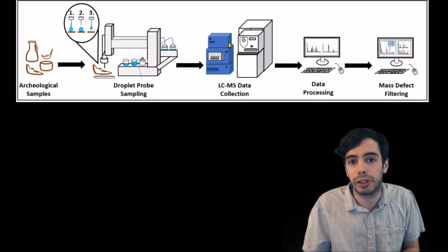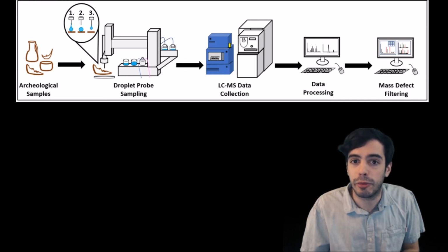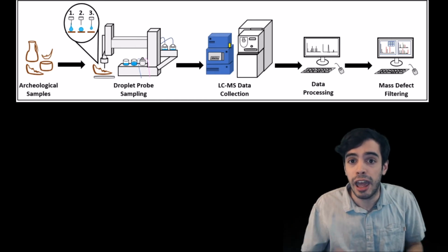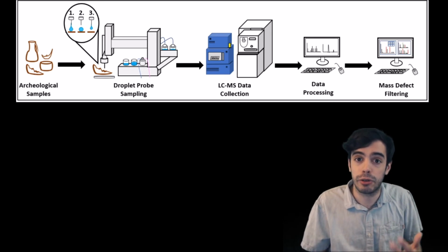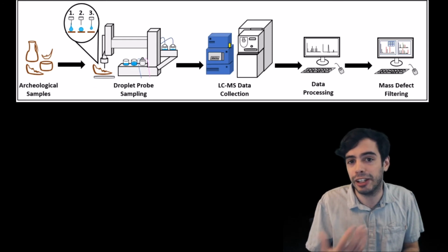And the liquid chromatography coupled with the mass spectrometry system is able to generate chemical information such as retention time, UV absorbance of the compounds. Moreover, it helps us to separate the compounds out from each other, from the mixture, and then using the mass spectrometer we are able to acquire high resolution accurate mass measurements as well as a fragmentation pattern of each compound, which acts like a fingerprint.